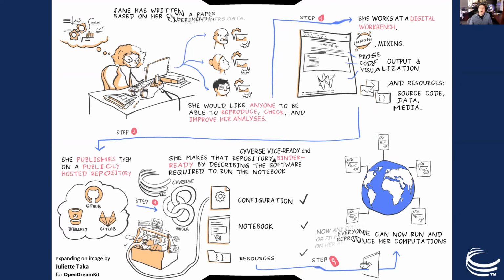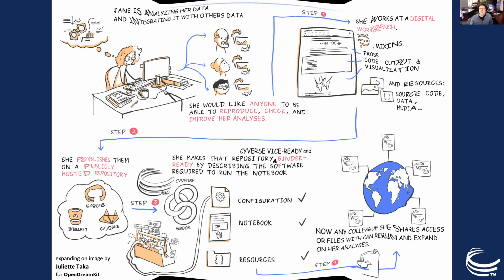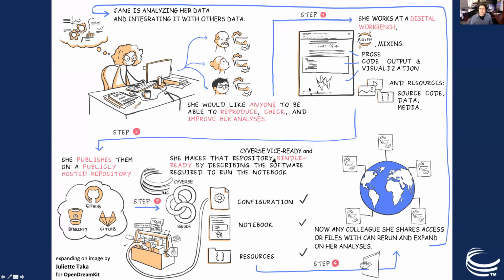But let's rewind time a little here and get back to closer to what we'll be doing today. You probably have data and you want to use PatMatch or Circos to analyze them. And so that fits in better here. You can start to think of it as an iterative thing, because you're going to get input from people and it would be nice to share with them. Maybe not the public yet, but your collaborators.